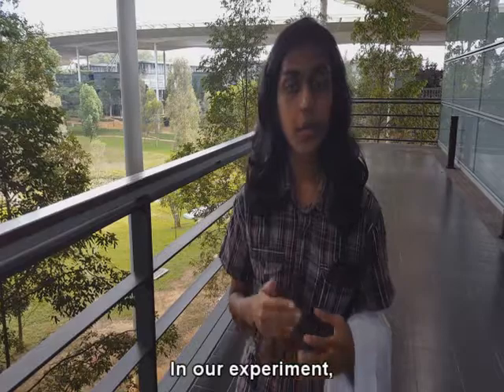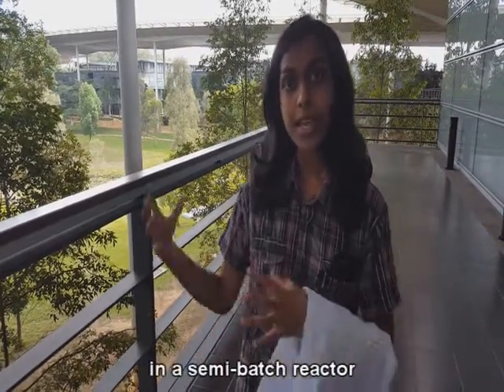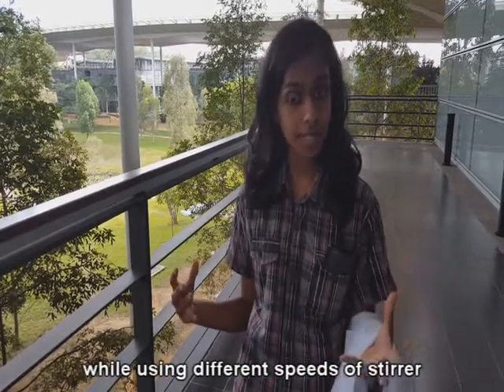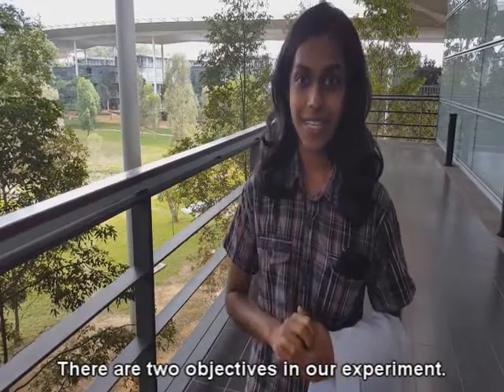In our experiment, we will be using ethyl acetate and sodium hydroxide solutions in a semi-batch reactor, while using different speeds of stirrer to agitate the reaction. There are 2 objectives in our experiment.